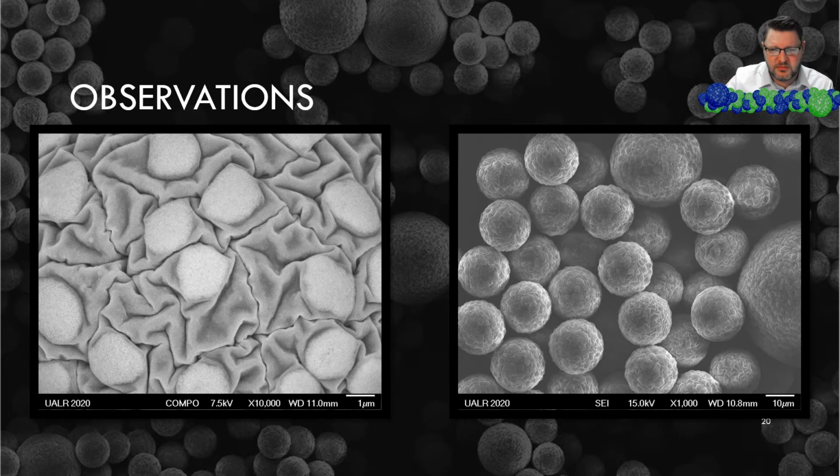Next, the image on the left is at 10,000 times magnification, and you can again see these hyperdense areas, which are the yttrium 90, and then again you can see the carbon resin around. Over here to the right, this is without XPS, so you do lose a lot of this detail.